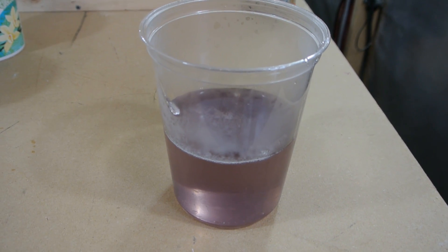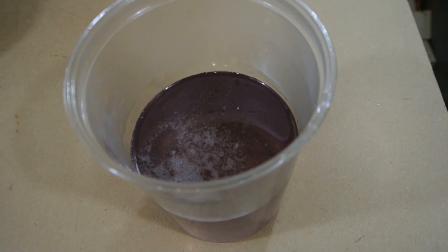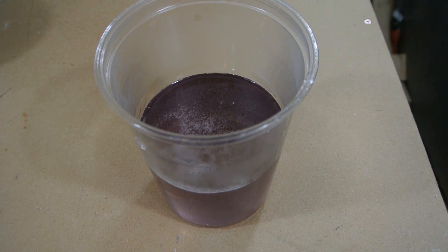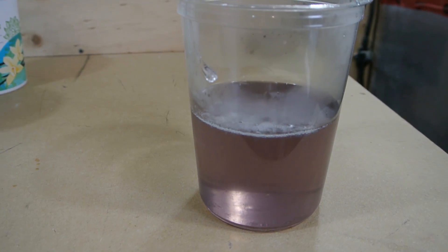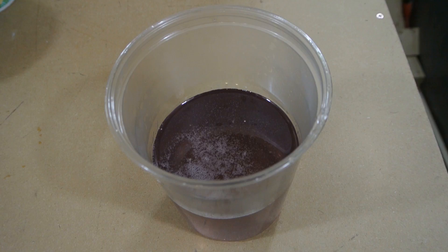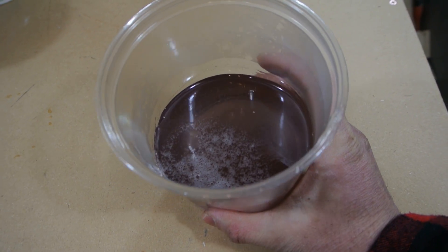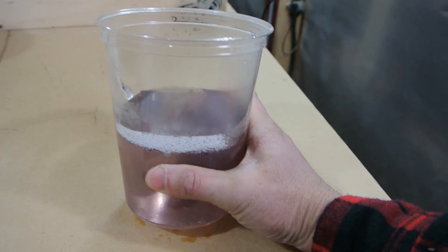Here's the final product - I poured it out after it cooled off into a container for storage. I'm going to make up another batch or two to make sure I have enough. So that's it, that's how you make sodium silicate, aka water glass. Really interesting stuff - it's been around a really long time. I guess it's just kind of fallen out of favor because of new technologies.